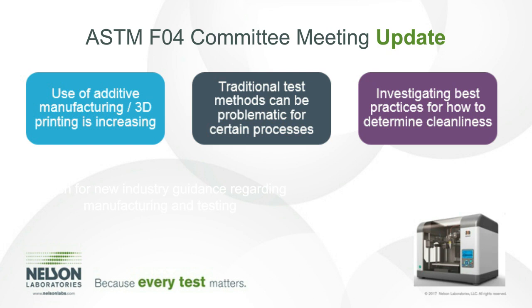At the last ASTM committee, back in May of this year, I'm on that committee, and the Cleanliness Task Group had the FDA there, and the FDA presented on research that they've been doing on various additive manufacturing procedures. Specifically, if particulates are a concern for your additive manufacturing or 3D printed devices, routine methods to test cleanliness, specifically ultrasonic extraction methods, seem to be inappropriate to look for these particulates.